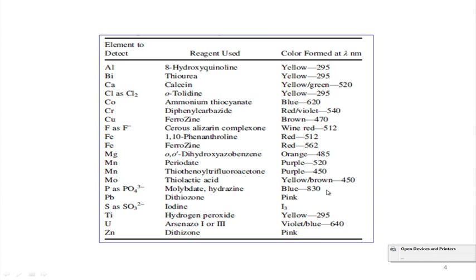In the NIR region, the wavelength for this one is 830. So, the spectrophotometer can nicely detect that absorption, where an amount of light will be absorbed by the medium and the amount of light reaching the detector will be detected over there.